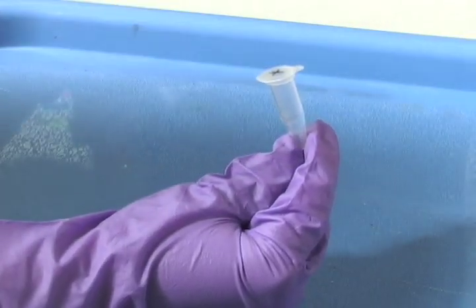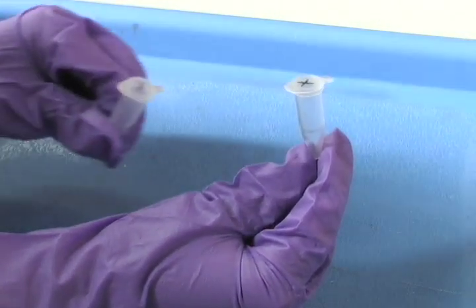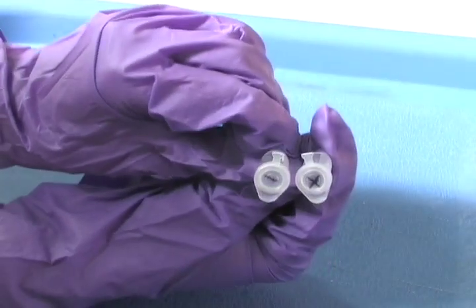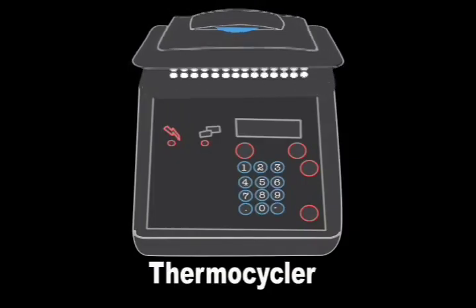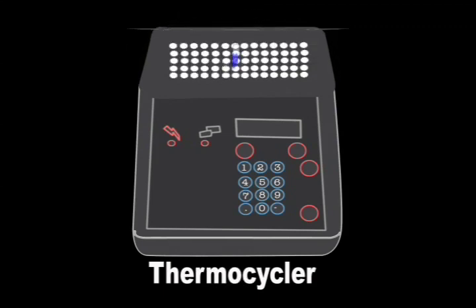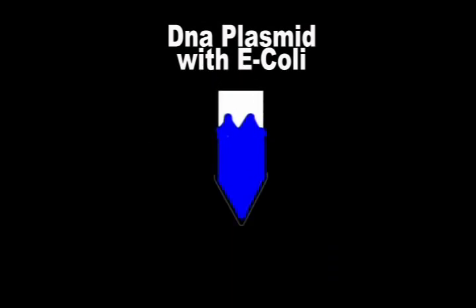Yesterday, we created primers containing a mutation. Then we used that primer in PCR to create millions of mutated plasmids. We will start our procedure today by taking the PCR tube out of the thermocycler to complete the final steps of PCR. Next, we will transform our newly created DNA plasmid with Escherichia coli, or E. coli, in order to produce our new fluorescent protein.